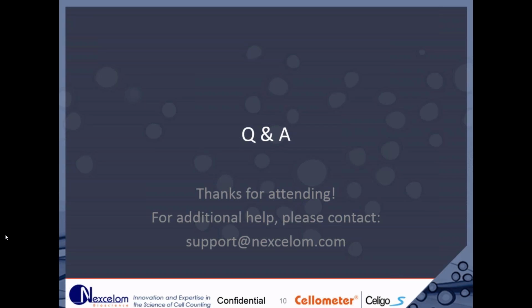Dendrites. Okay, I gotcha. Sounds more like neurons that the person's looking for. So bright field is not necessary. You don't have to image with bright field, but I know that a lot of customers just like to see that their cells are there, and visually bright field is just a good added image to have. It didn't add any quantitative information for us. It was more of a safety visualization for us. So you don't have to include it.